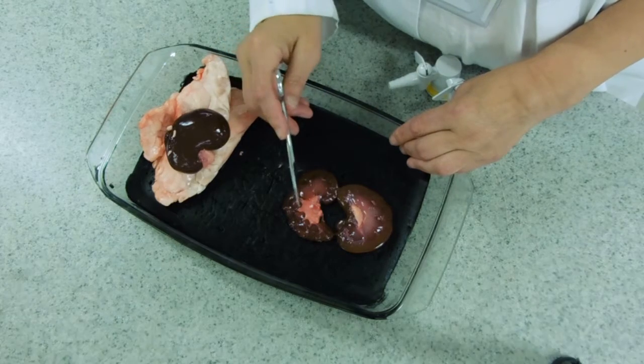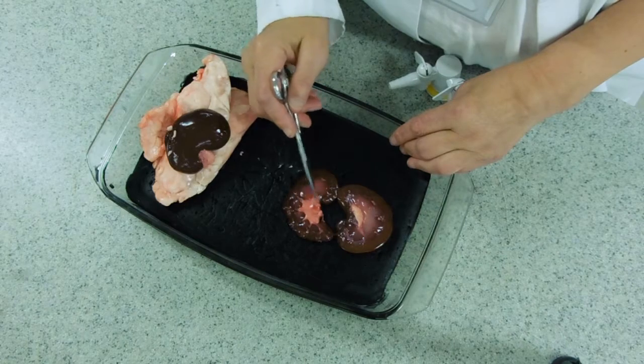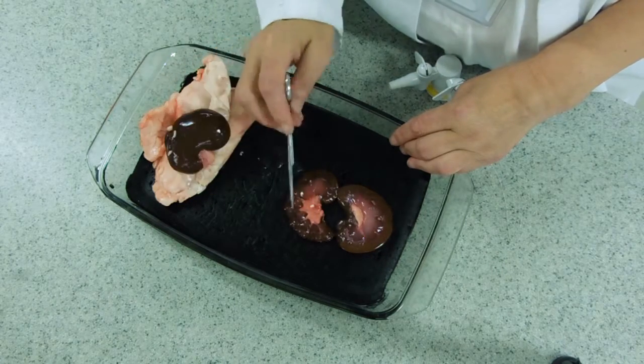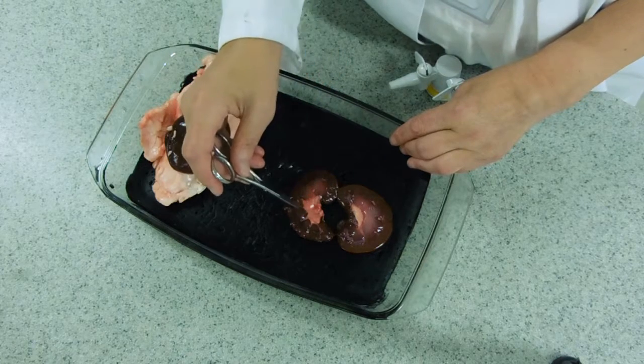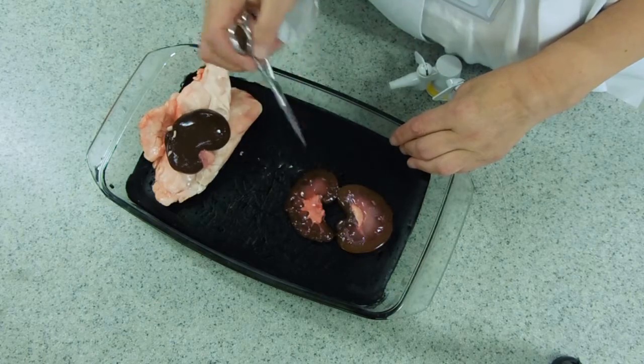The medulla is arranged into little pyramids — you can see one of these little triangular pyramids — with a little gap so that the formed urine, as it's coming down through the collecting duct, drains into that gap and out through the ureter.